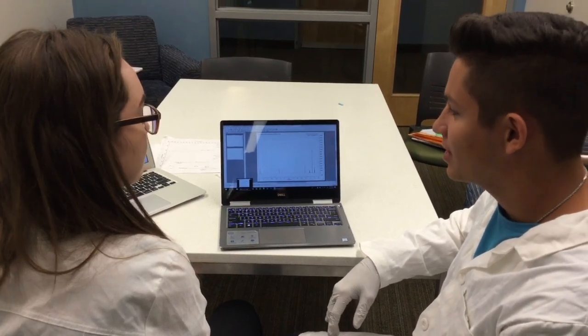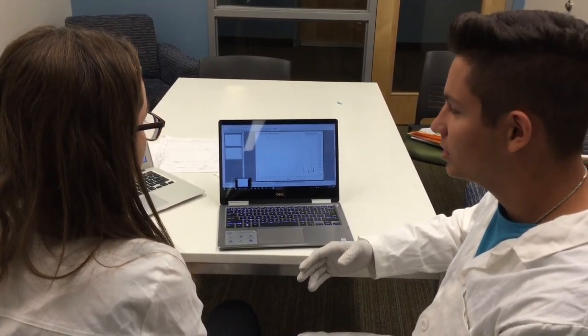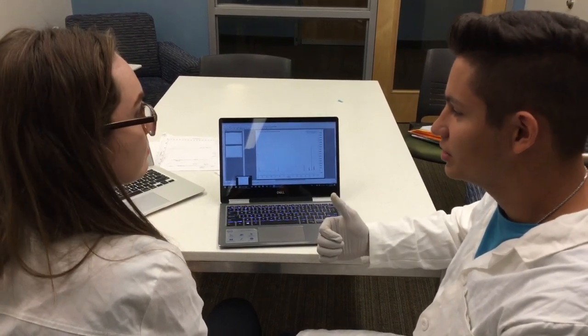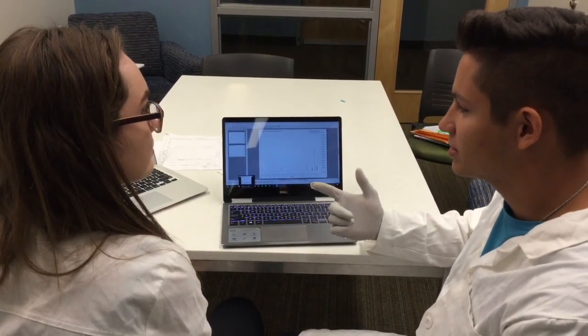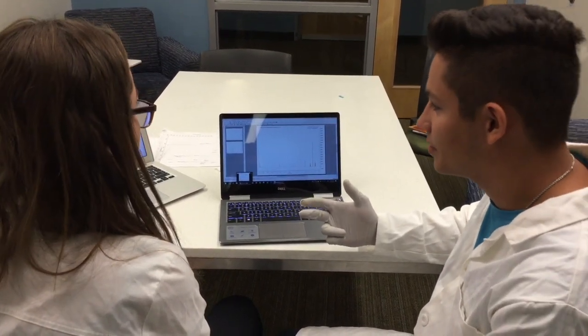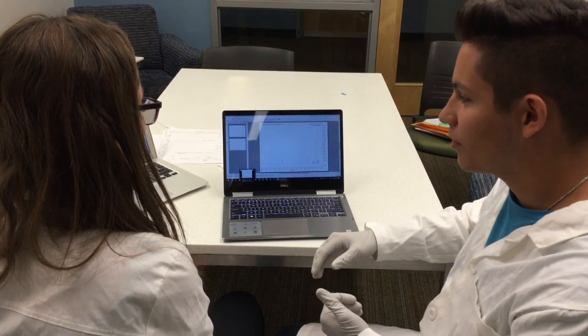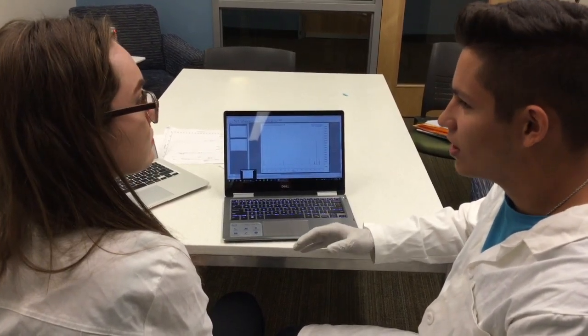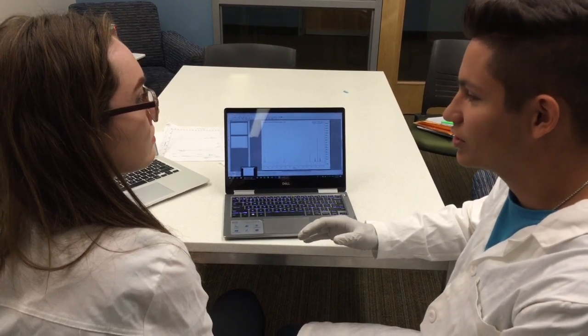So now that we've analyzed all of our data, we can start to piece it together and identify our two substances. Through basic guess and check, we found two possible molecular formulas for our substances that only contain carbon, hydrogen, and oxygen, match the required molar masses, and have isomers that only contain bonds we detected in our FTIR experiment. These substances are C4H10O and C9H10O2. However, this does not tell us the exact structure of our molecules.